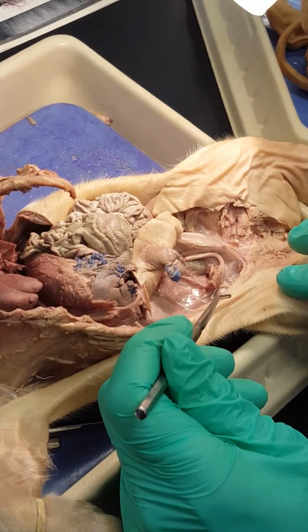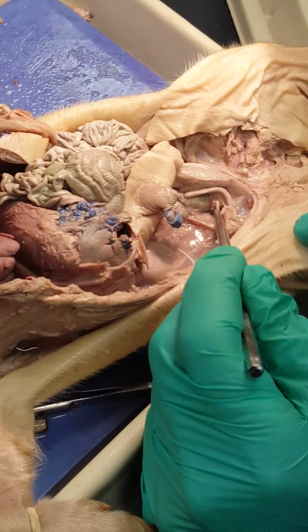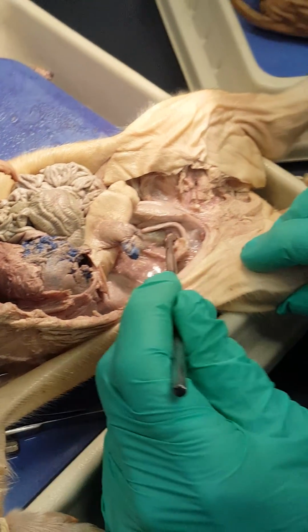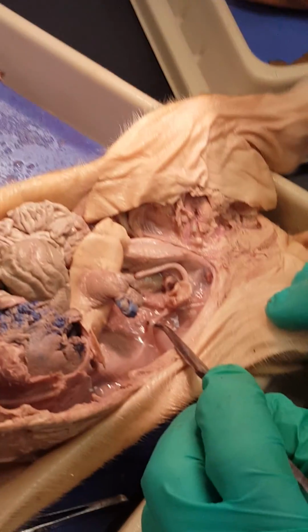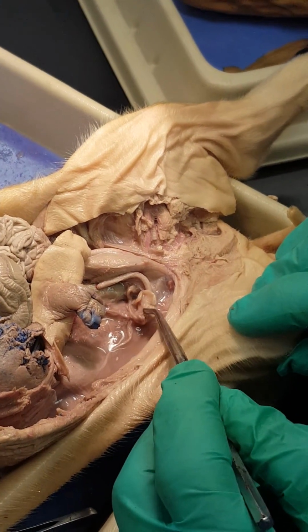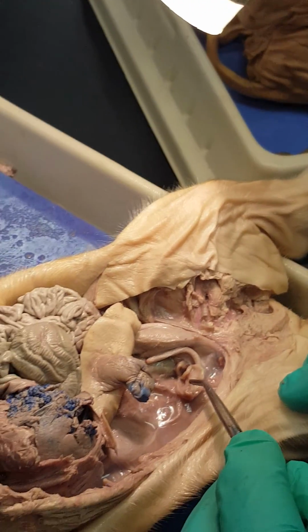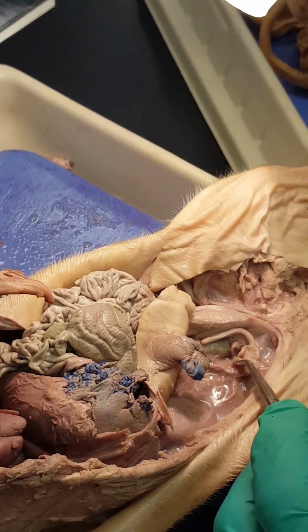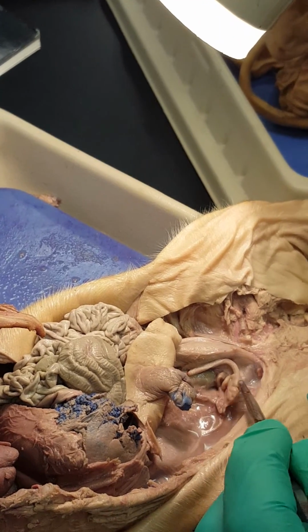So where is the uterus on this page, or is it not really? Well, you can see the arms of the uterus. Okay. So mammals like this have what we call a bicornate uterus. The equivalent of fallopian tubes is actually the oviduct. And where's the ovary? Right there. So does it go up and then back down? The eggs in this case have to go up into the funnel, back down the oviducts, and into the uterus. Okay. Weird.